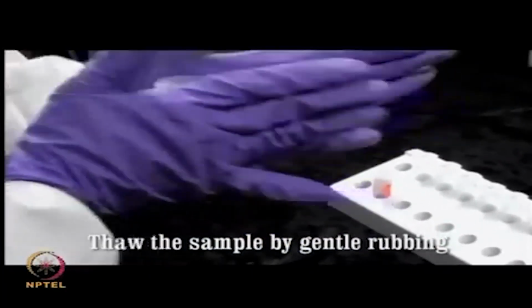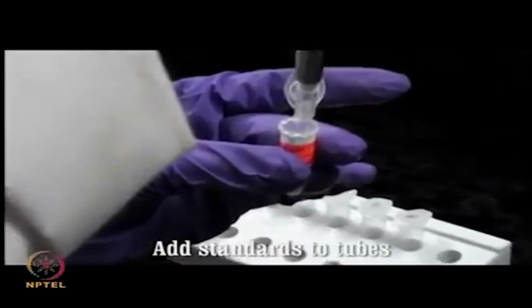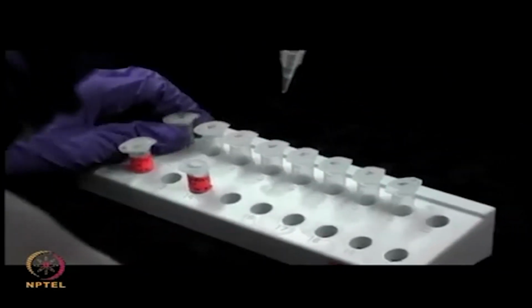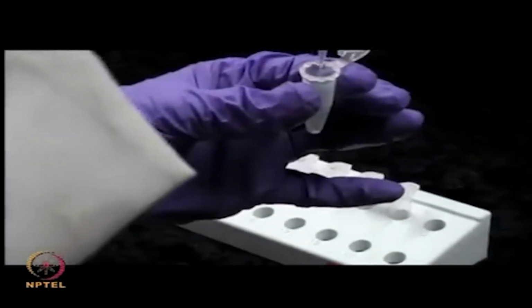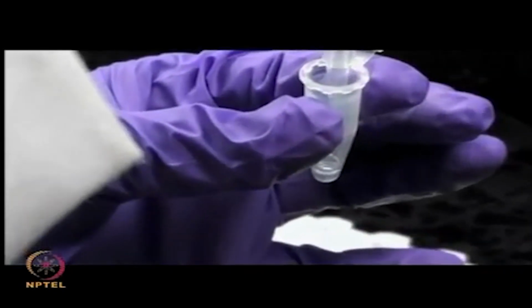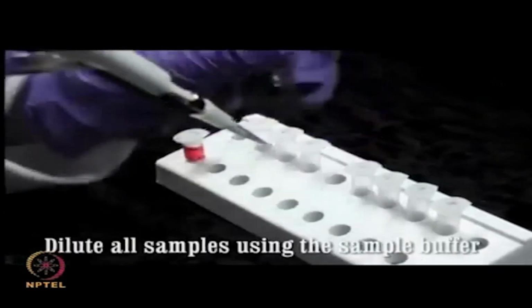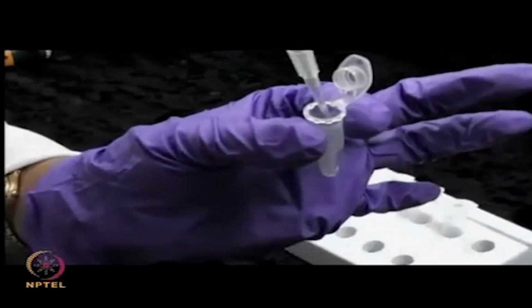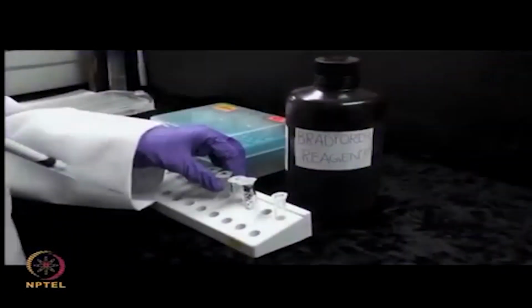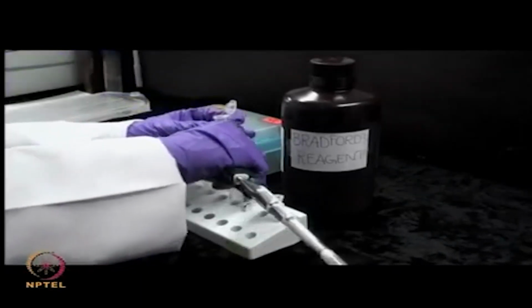Prepare the sample buffer required for diluting samples during the assay and mix it well. Add an increasing concentration of standard protein sample to each of the designated tubes. Bovine serum albumin is often used as a standard. Then add the unknown protein sample whose concentration is to be determined to the appropriately labeled tube. Dilute all the samples uniformly using the sample buffer. Then add the Bradford color reagent to each tube and mix well.